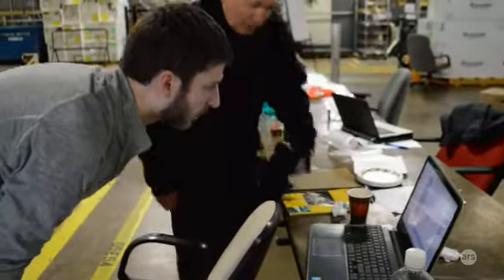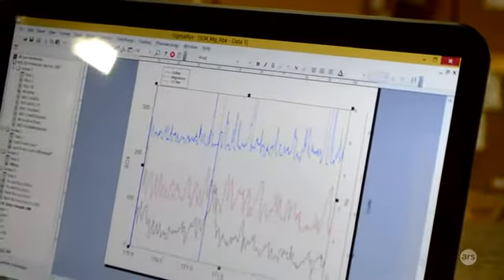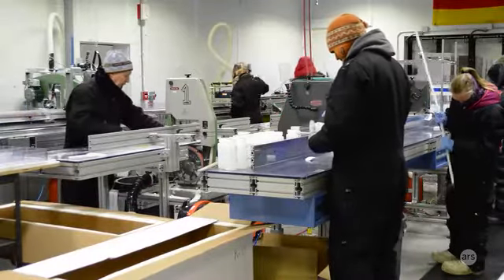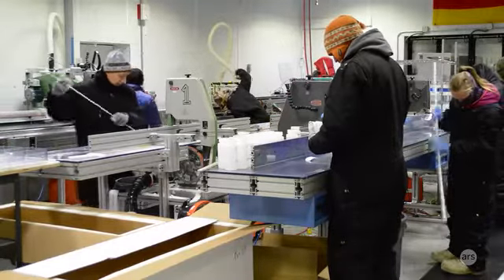Our portion, we do the chemistry on the ice core. The primary purpose of that is to date the ice core. So you get seasonal changes in different chemicals in the ice for various reasons. And if you can get samples small enough, you can actually see those changes and then count annual layers going back in time.